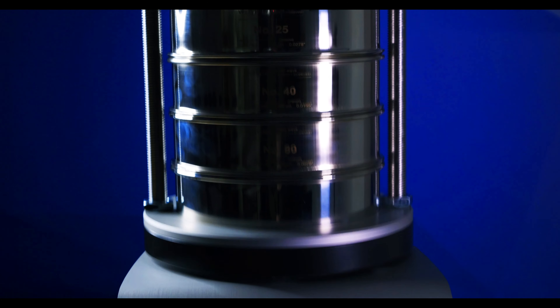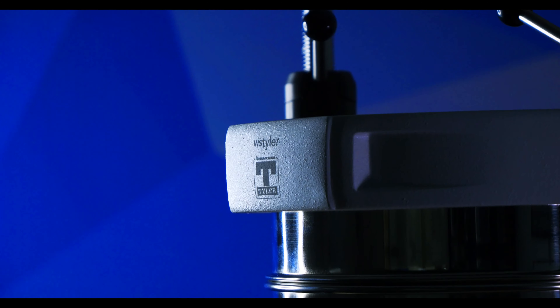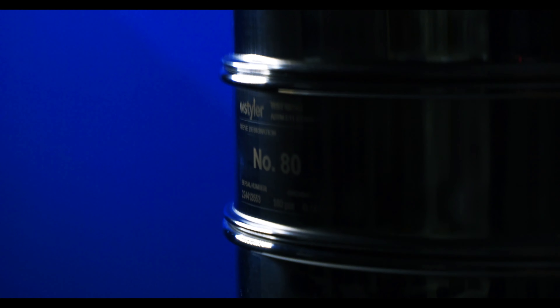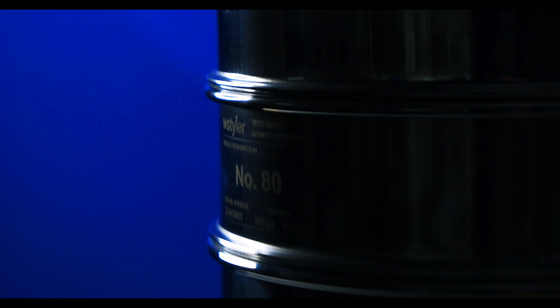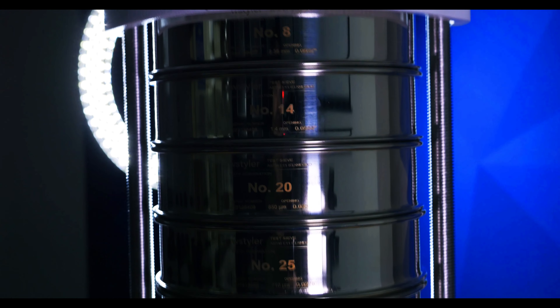The ePremium uses a unique three-dimensional elliptical motion to test sample material accurately. To do so, a heavy-duty magnet, which is attached to a spring, is electrically charged to cause the spring to rapidly compress and decompress thousands of times. As a result, the sieve plate makes subtle vibrations, creating the one-of-a-kind 3D motion. This 3D motion takes the particles in the sieve stack and moves them in a flat plane, while the sieve plate uses the micro-vibrations of the spring to move the sieve stack up and down. These movements work together to more or less mimic the actions of the mechanical RX-29 sieve shaker.